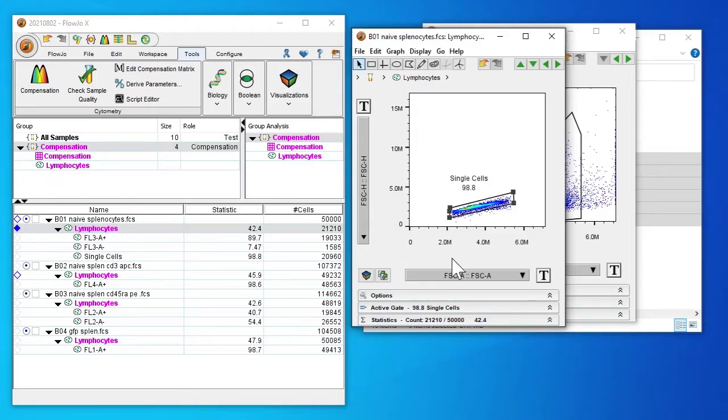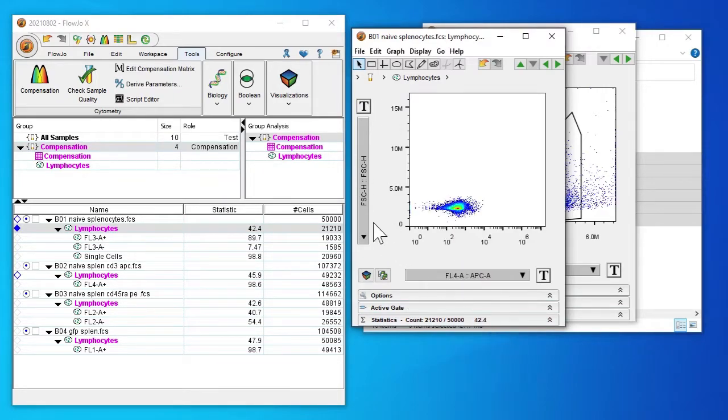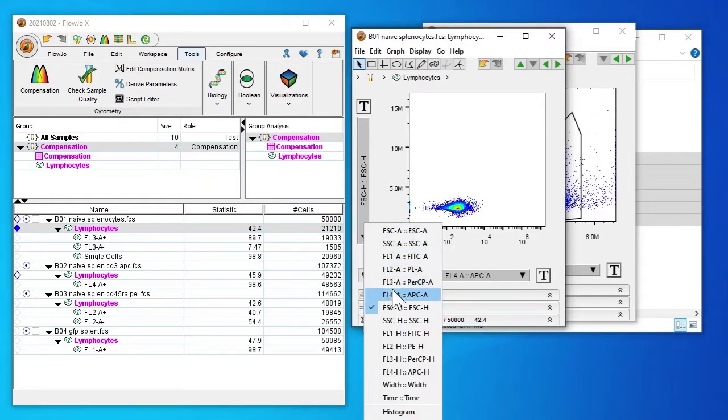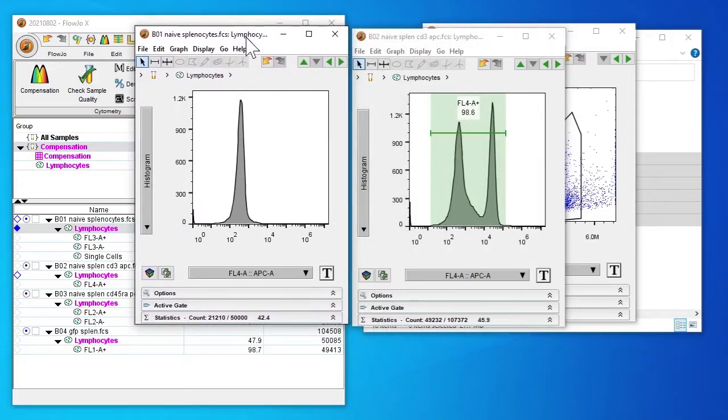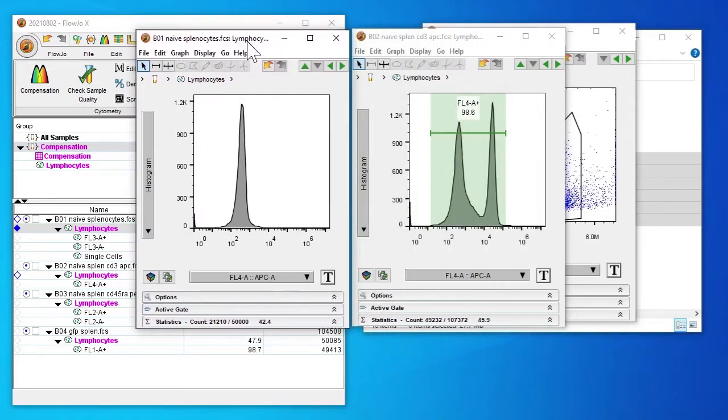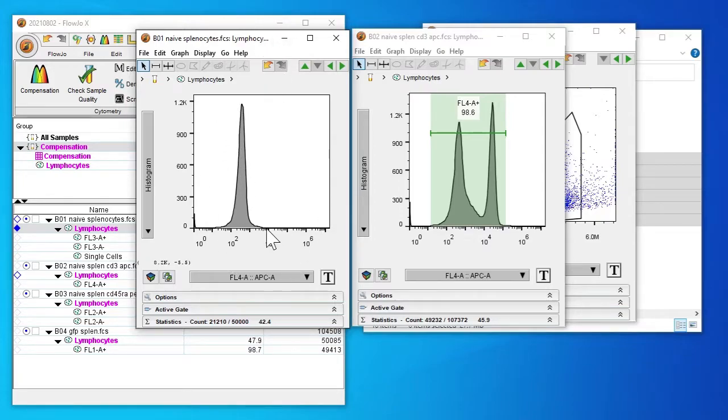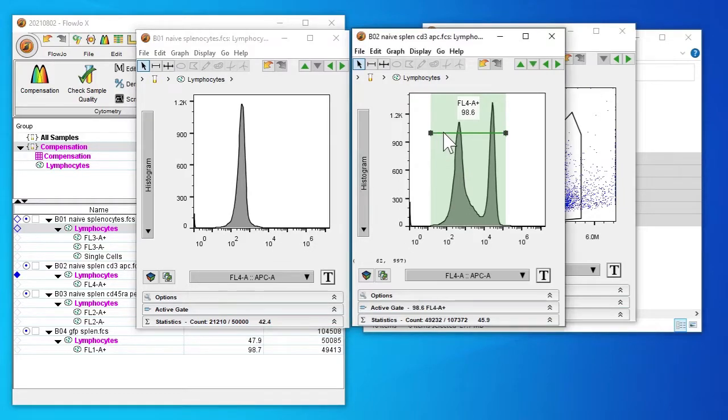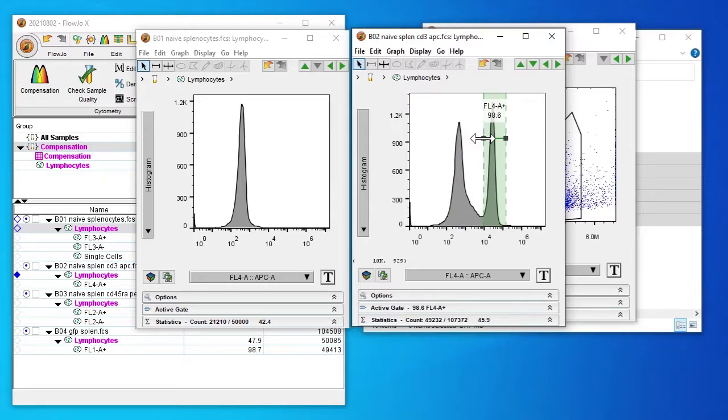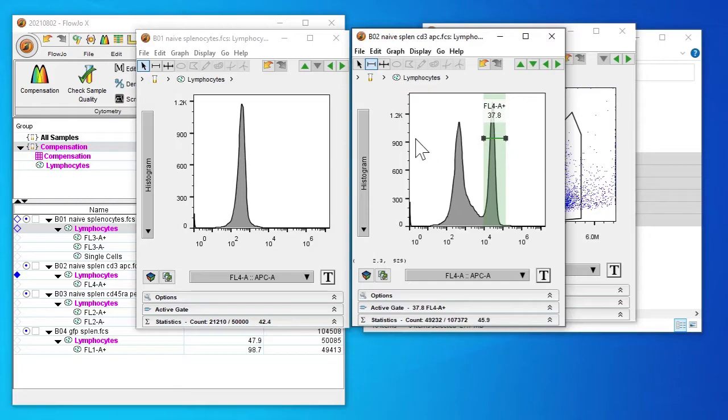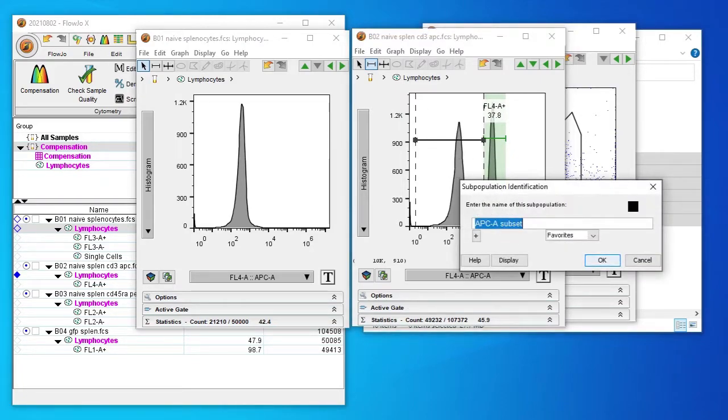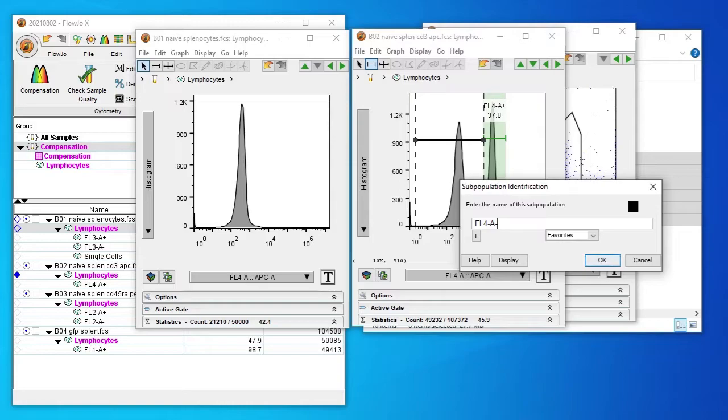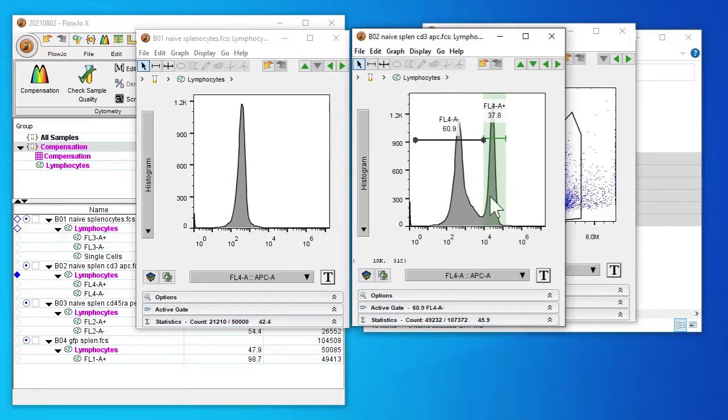So we need to set the negative as well. So here is our non-stained control. And we can see that the peak ends around 10 to the power of 4. So that will be our cutoff mark for our negative signal. So anything below 10 to the power of 4 will be our APC minus. Anything above will be our APC positive. So we'll set this as FL4A minus.